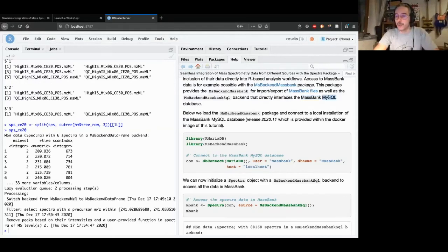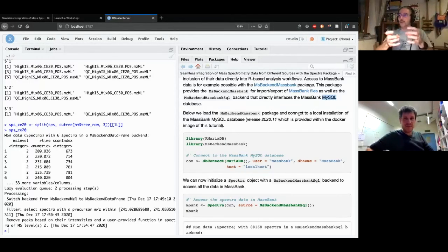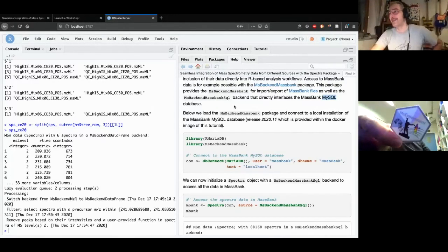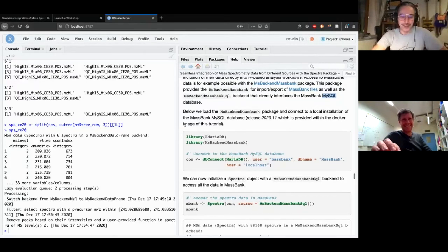We are going to continue developing that, and the glue in the end is another package which I think is called MSExperiment. Is that true, Laurent? I think this will be the experimental wrapper for all these objects. It contains all the data from one experiment, with chromatograms and spectra in it. We also have a sticker for that, although we did not really start the package. It's always good to start with that sticker. Okay, so I hope that answered the question.